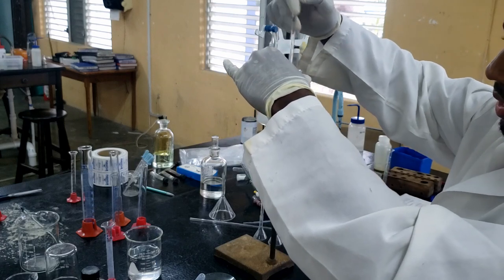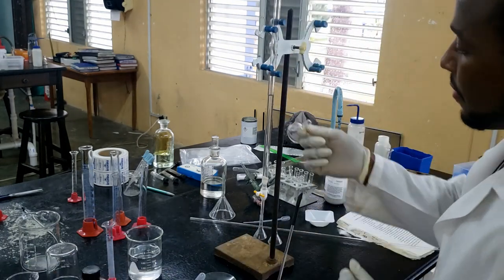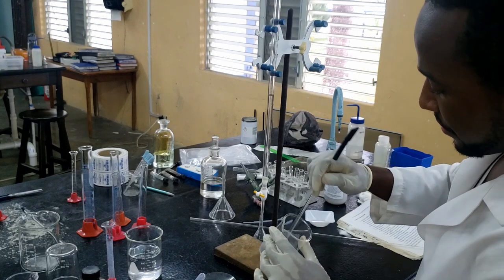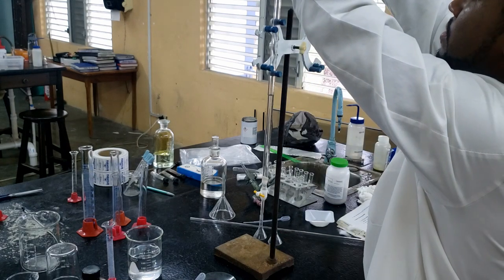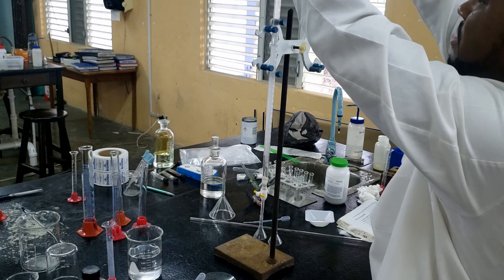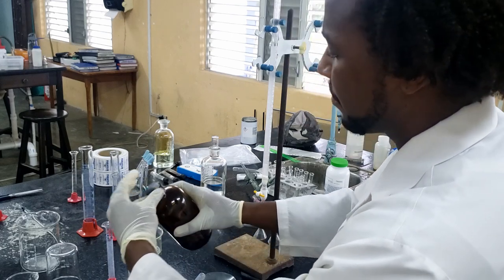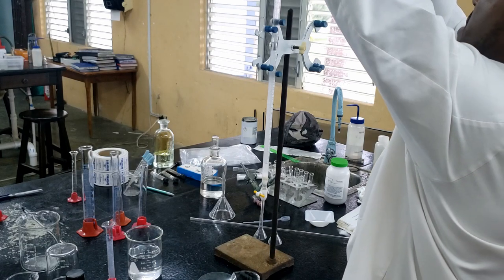So we have our silica slush going now. For this part, I'll use one of my funnels with the wider nozzle. And I'm just going to pour this silica slush into the burette. It might not all get in, so what I normally do is I take some more eluent. I can just rinse out as much of that silica as possible.